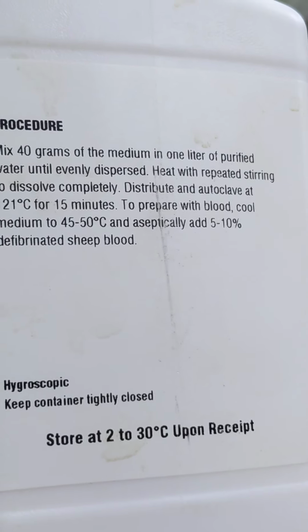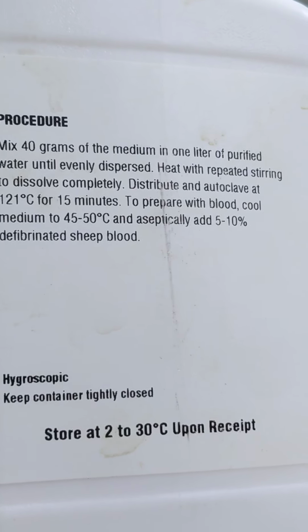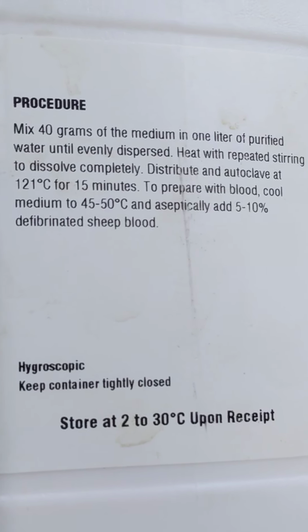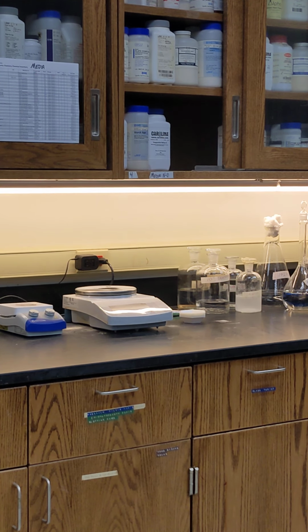One of the nice things about these media as well is they give you the recipe right on the packaging. And notice it also tells me that I need to autoclave it at 121 Celsius for 15 minutes. So we'll talk about that in a second as well.